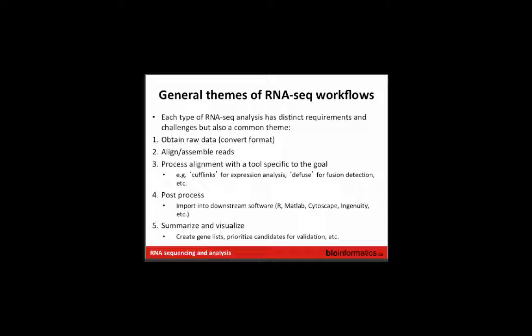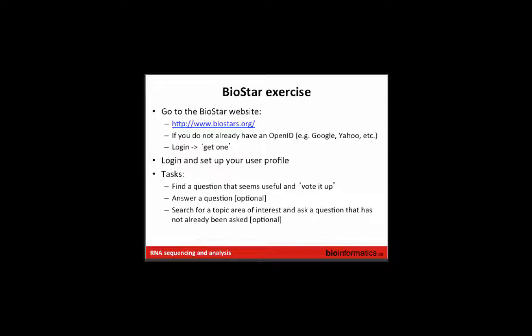So there's a differential expression tool. There's a fusion detection tool. There's a virus discovery tool. But you're going to have some tool that basically takes a BAM as input and asks one of these questions of the data. And there'll be some post-processing, so you might be importing it into downstream software for visualization or statistics or further summary. And then there'll be your final summarization, visualization, reviewing the results and trying to develop validation experiments, create gene lists, prioritize candidates for further study, and so forth.